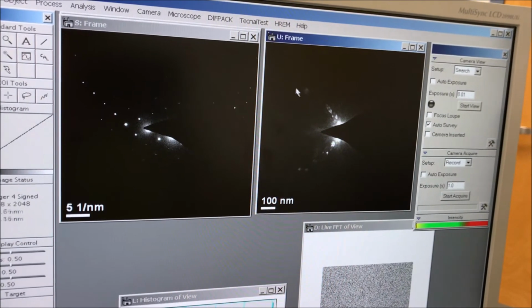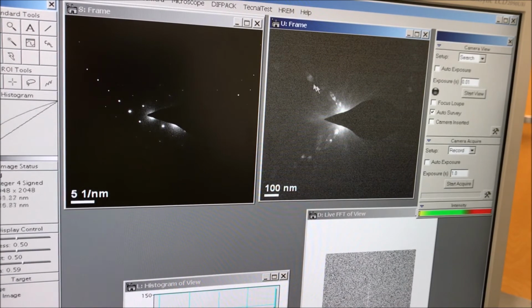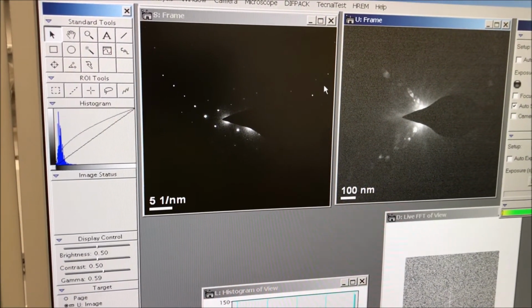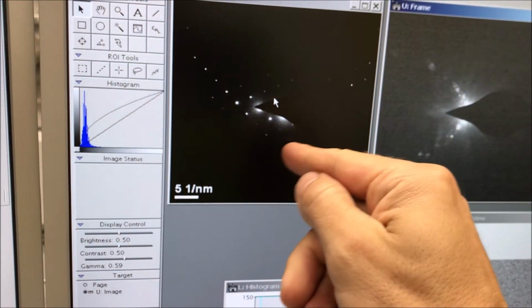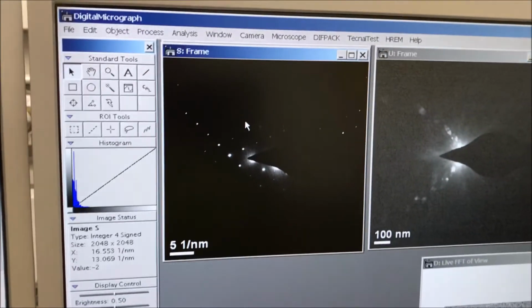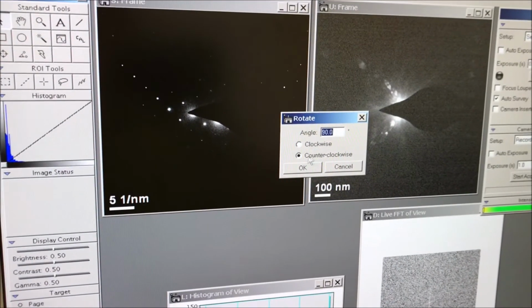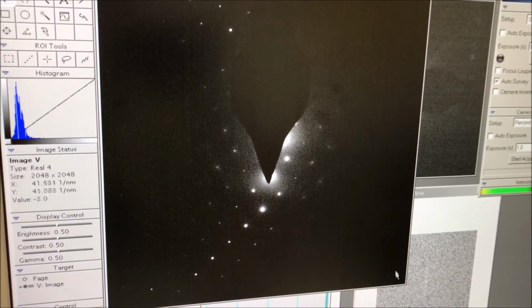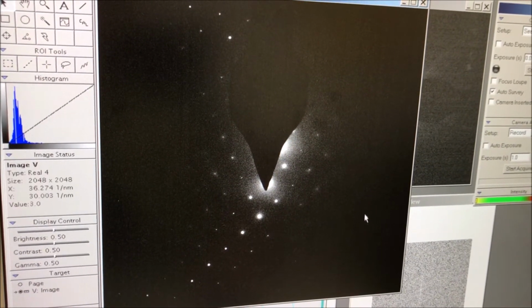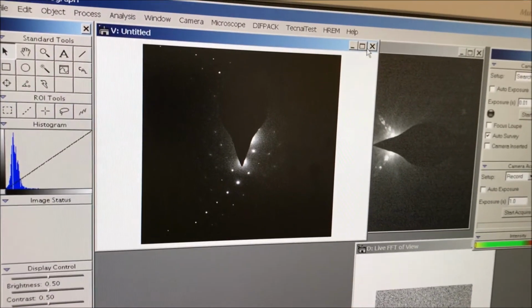So we'll start the video again. We see that's curving to the left. Make a little adjustment here to make it easier to see. That's curving up. So again, if we're rotating the pattern relative to the image, we can see now that that has to be rotated counterclockwise 90 degrees. Or conversely, 270 clockwise, that would be valid. Those are the same, they're not unique. Okay, but now we have correctly figured out the rotation calibration.